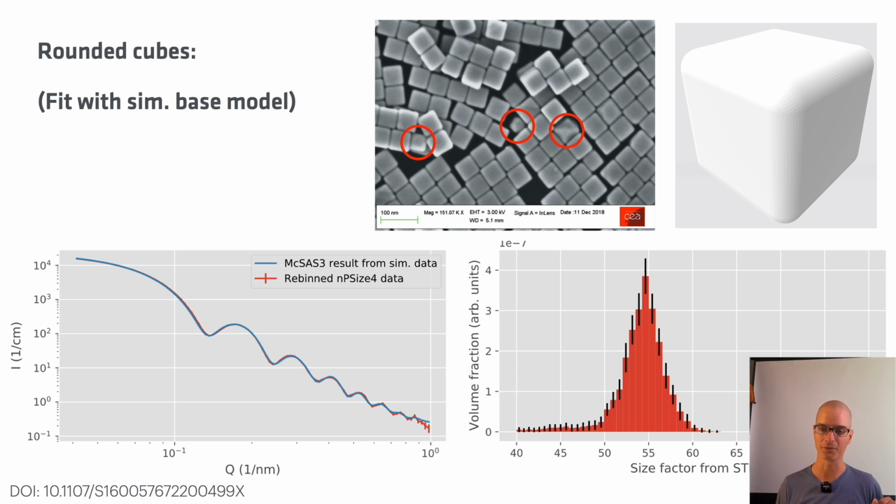Now these particles, they came from the PTB, and they always make wonderful monodisperse or very low dispersity samples, very far away from many of the industrial materials that come across our desk. But nonetheless, very interesting, and perhaps an interesting application if you have samples that don't have a specific form factor predefined.